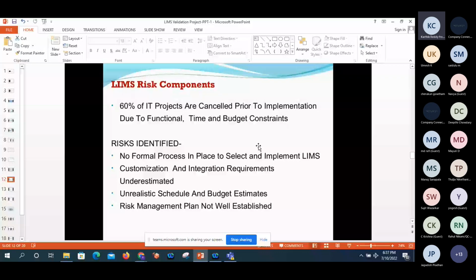People may think that the output that was coming earlier with paper-based is not coming now. But management should take the decision on how important it is from the regulatory perspective, and act accordingly. The main reason for cancellation is that the budget is huge, some crores, like 1 to 10, 15, 20 crores for implementing the entire modules.